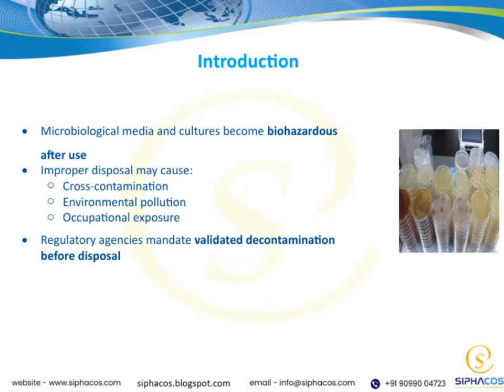Let's talk about the importance of proper disposal of microbiological media and cultures. Once these materials are used, they become biohazardous, meaning they can pose health risks if not handled correctly. Improper disposal can lead to several serious issues. For example, cross-contamination can occur, potentially spreading harmful microorganisms to other surfaces or materials. Environmental pollution is another concern, as pathogens could contaminate water or soil if not properly contained. And of course, there's the risk of occupational exposure, putting lab workers and others at risk of infection.